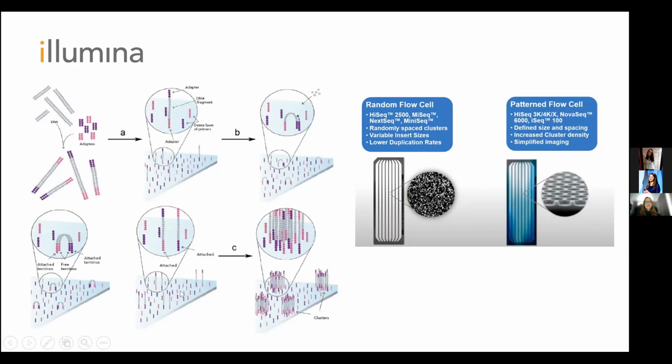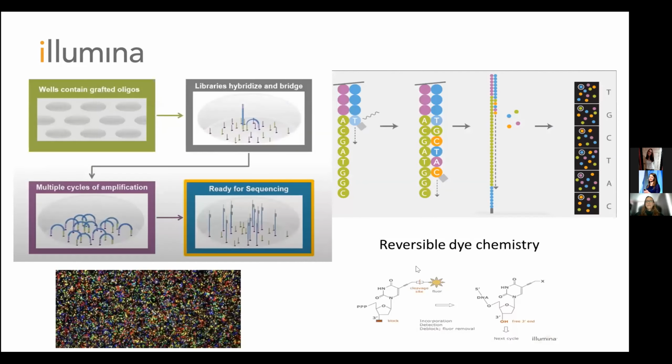The sequencing consists of three stages. First is the incorporation stage, during which four different nucleotides, each with its own specific fluorescent dye, are flooded over the flow cell, and one of the complementary nucleotides is incorporated in the chain.